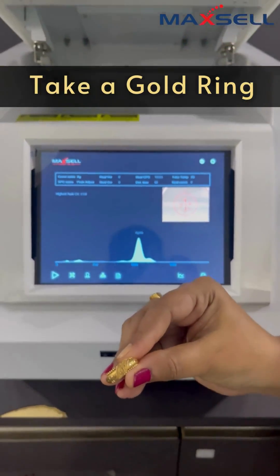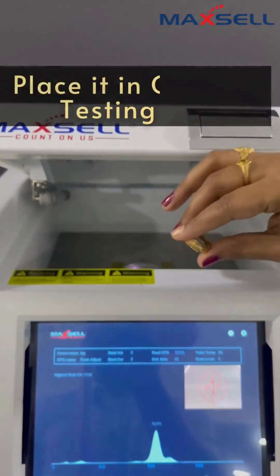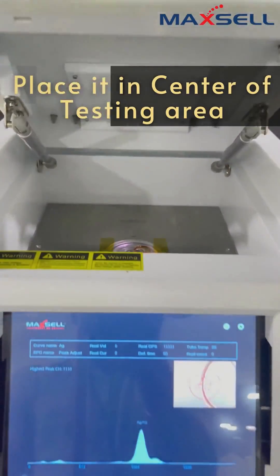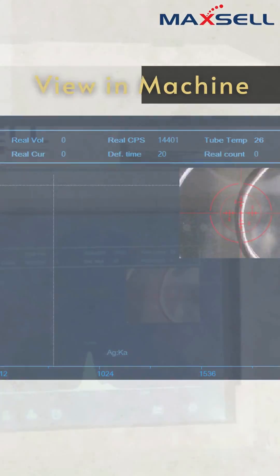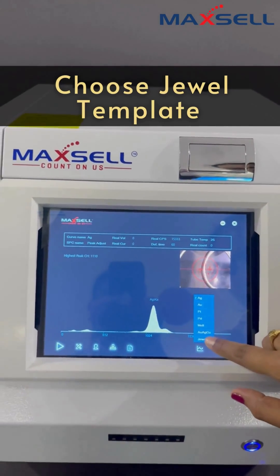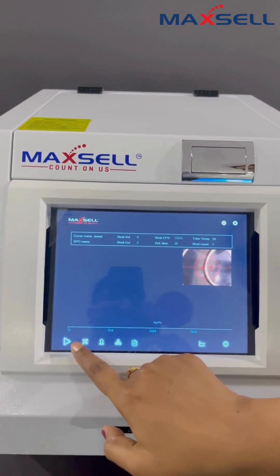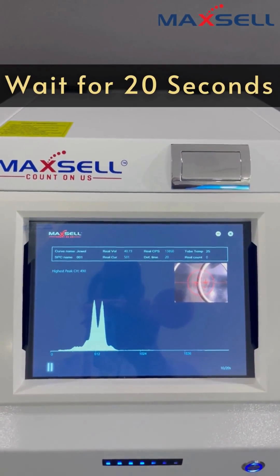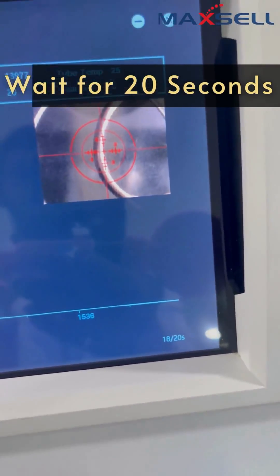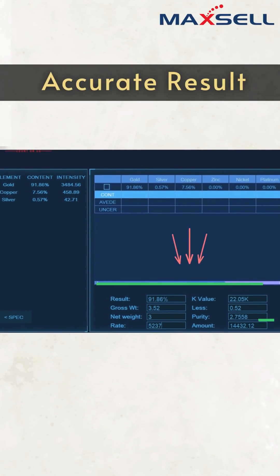Let's take a gold ring and place it in the center of the testing area. Choose the jewel template. Click play to start the test. Results are easy to read and show up in just 20 seconds. This is the result of the ring.